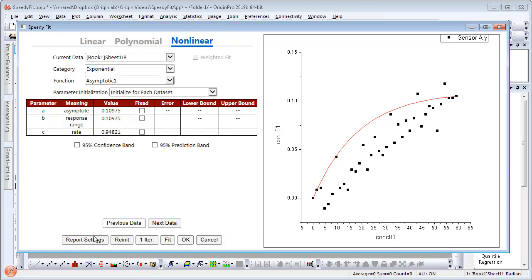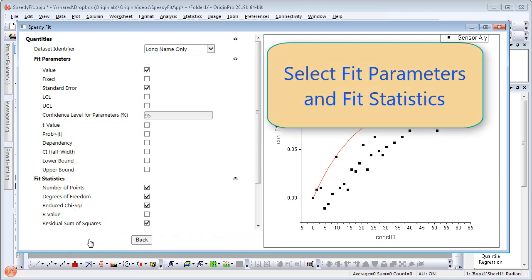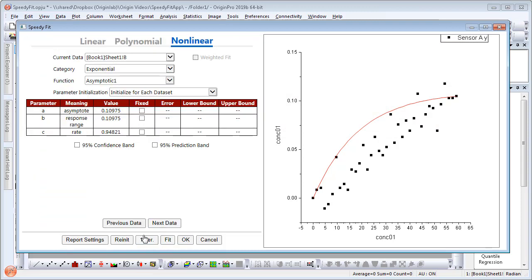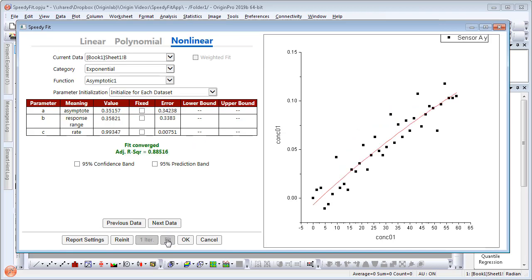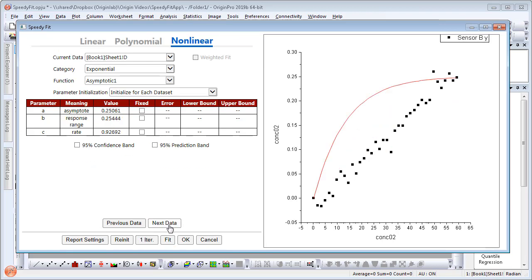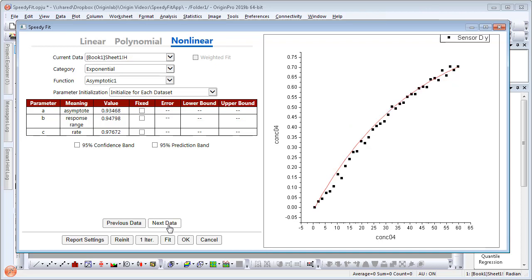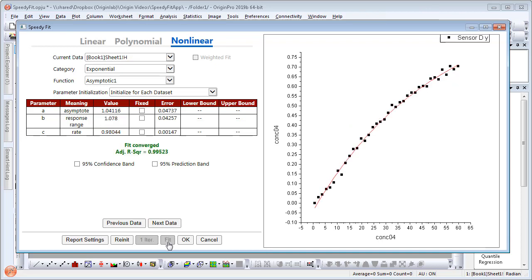Under report settings, you can select fit parameters and fit statistics as needed. Using the fit button, you can check and see how the fit is performing. Use the next data button to flip through your data sets. Stop at any particular one and perform the fit again.